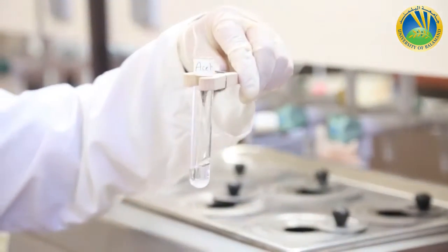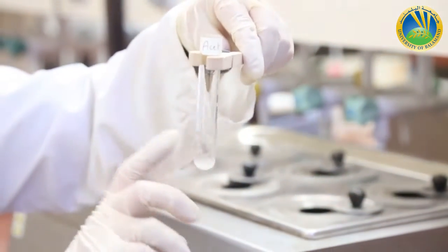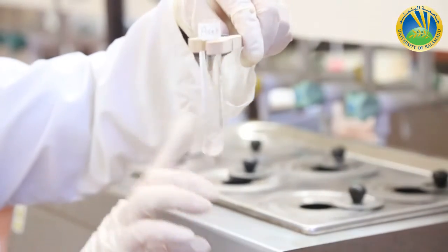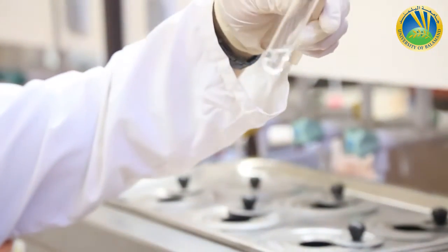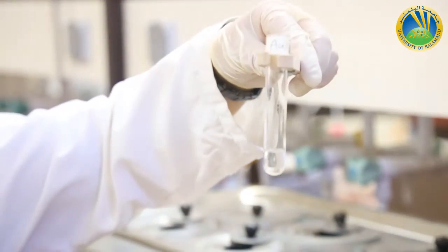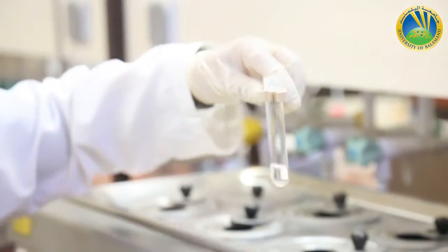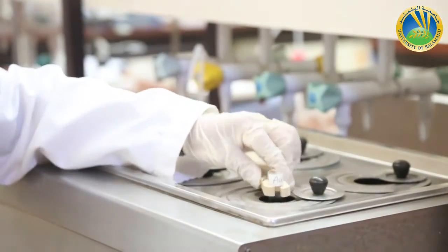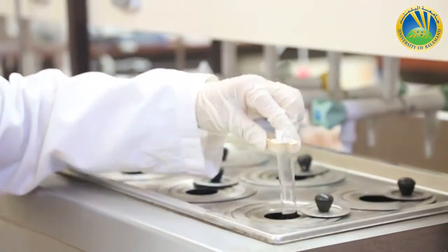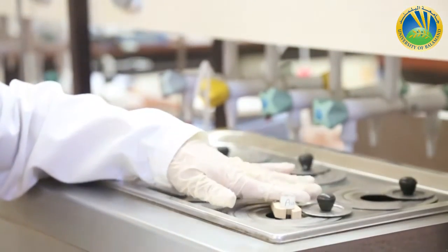Now I'm next to the third water bath, which is at 50 degrees, which is the boiling point of petroleum ether. I will start to do the tests. Acetanilide inside petroleum ether at cold. I can still see the granules, the same amount as I have added at the bottom of my tube, so I will go to the hot test at 50 degrees. Let me wait few seconds.